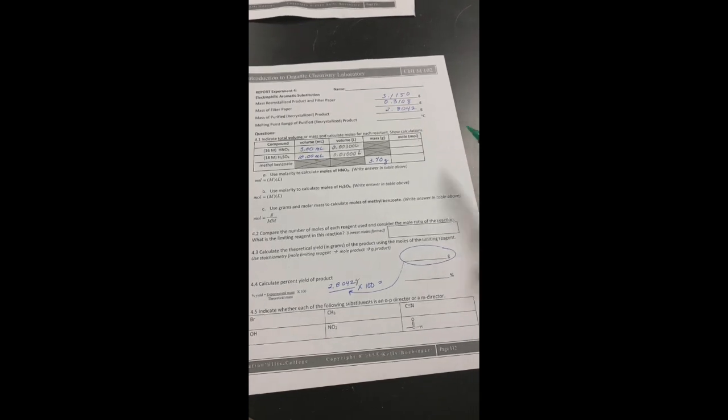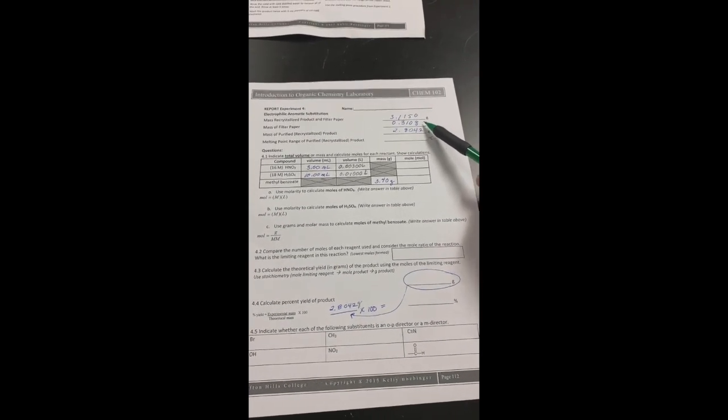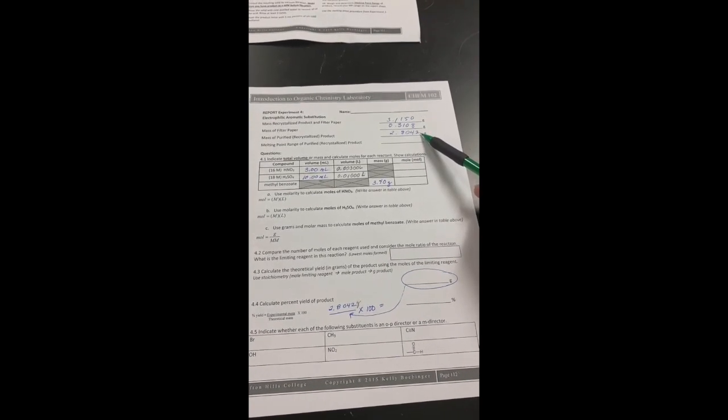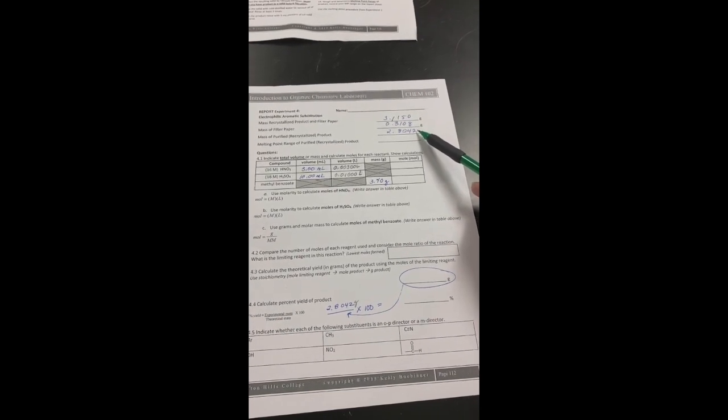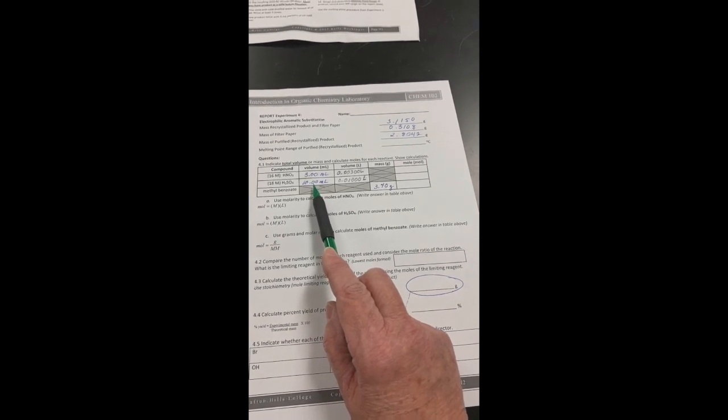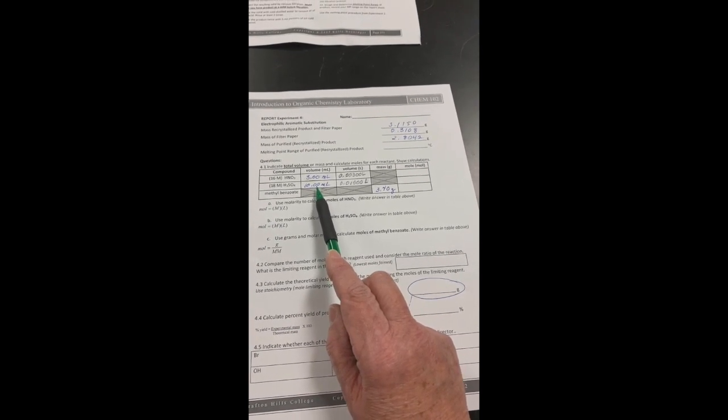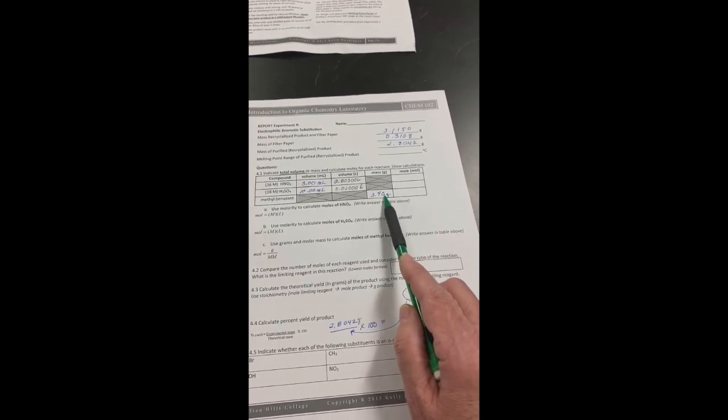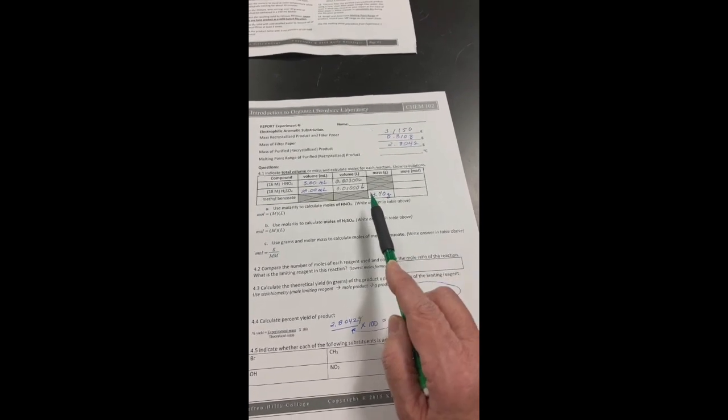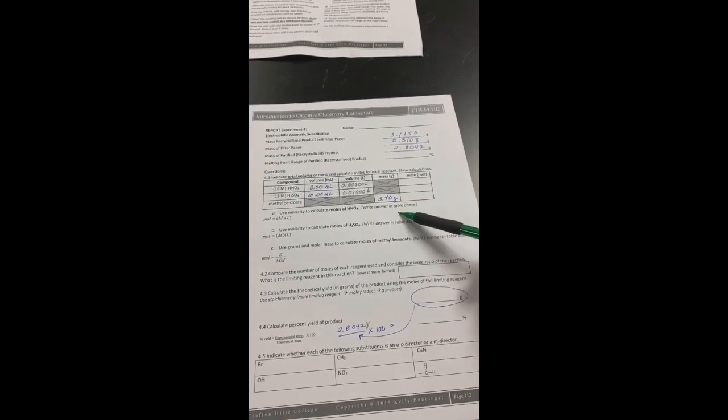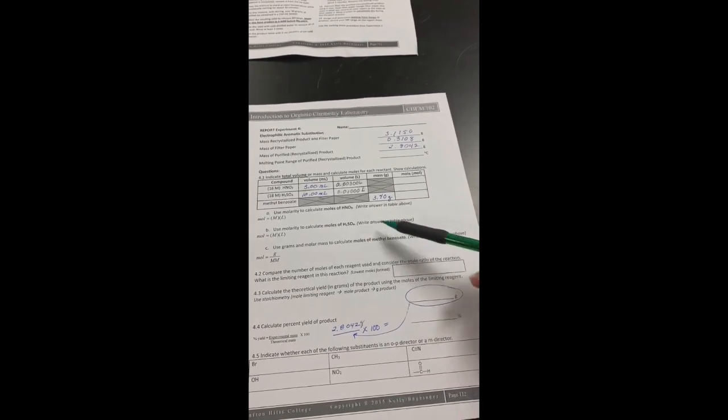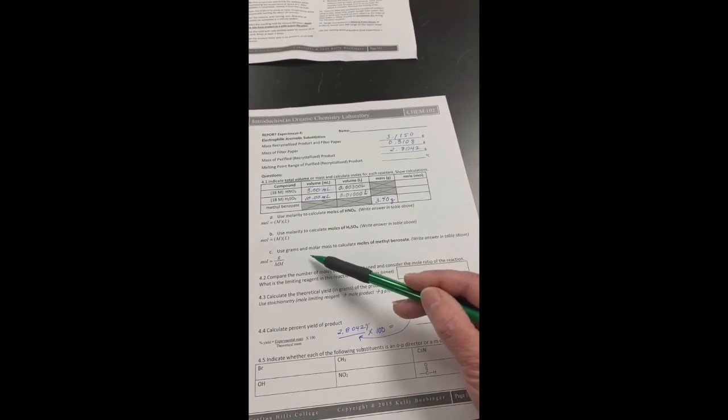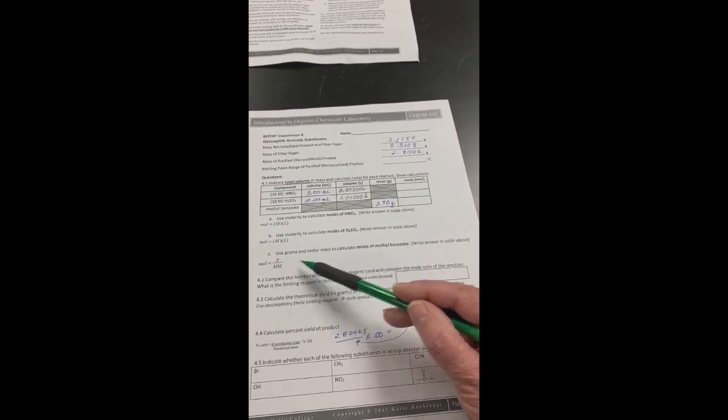For your report sheet, remember these first two numbers here came from an analytical balance. Those were experimental results. So we have a lot more sig figs we get to use here for the mass of purified product and that won't limit our sig figs too much because we actually have five of them there. Don't forget when you fill in the table, you actually used a total of 10 milliliters of sulfuric acid. It was two different steps. One time you did three mils, the other time was seven mils and converting those to liters. And the mass of the methyl benzoate is actually from the instructions. We measured the volume, but I gave you the mass. To calculate the moles here, you're going to calculate the moles of your nitric acid here. This is the formula, the moles of sulfuric acid here. And then because we have a mass, our methyl benzoate is going to be using this formula to figure out the moles.